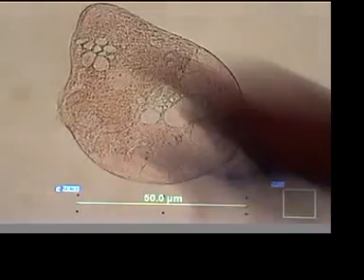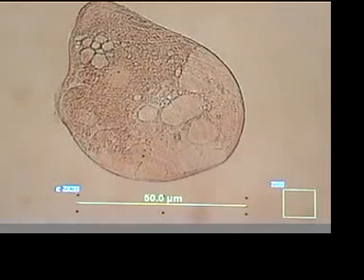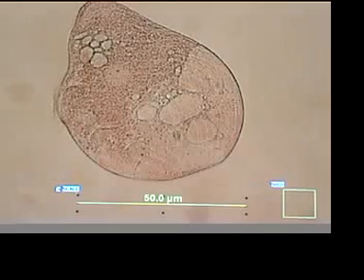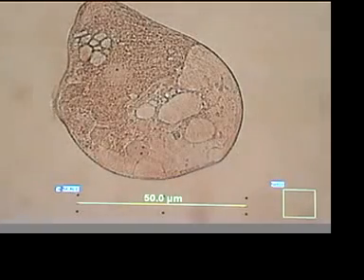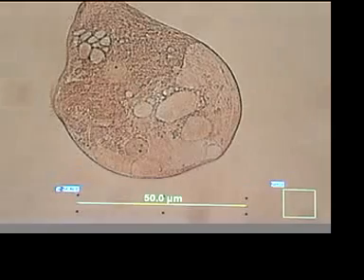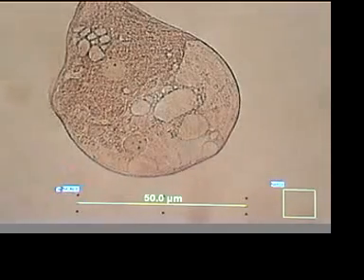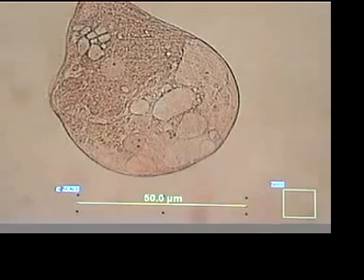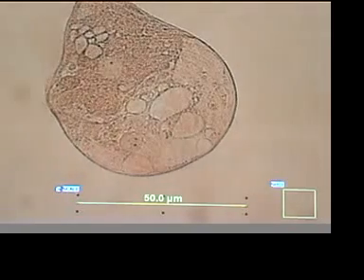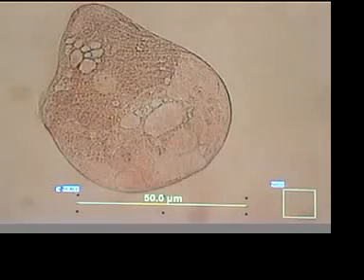There is a lot of cilia movement along this edge, but he's quite round and seems to have suffered some effects of the experiment. Let me check the scale there. The scale is accurate, so we may be seeing widespread effects on this one slide.